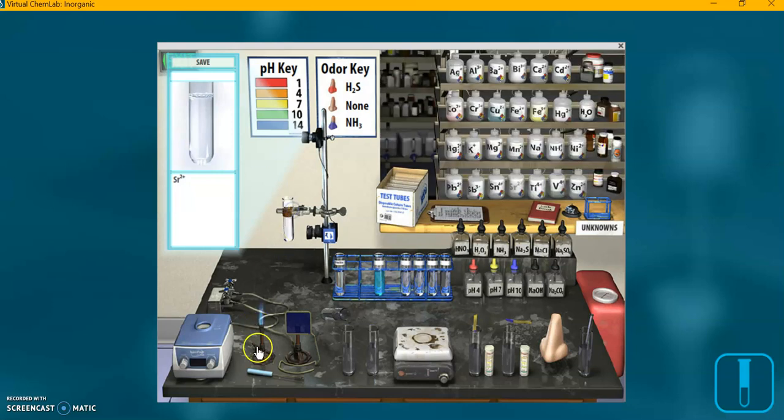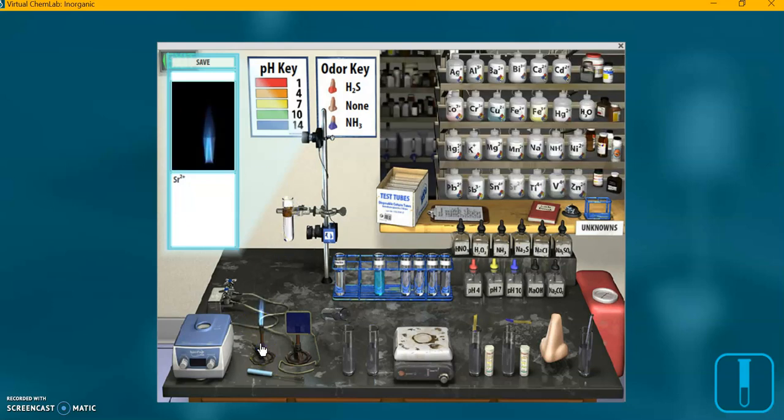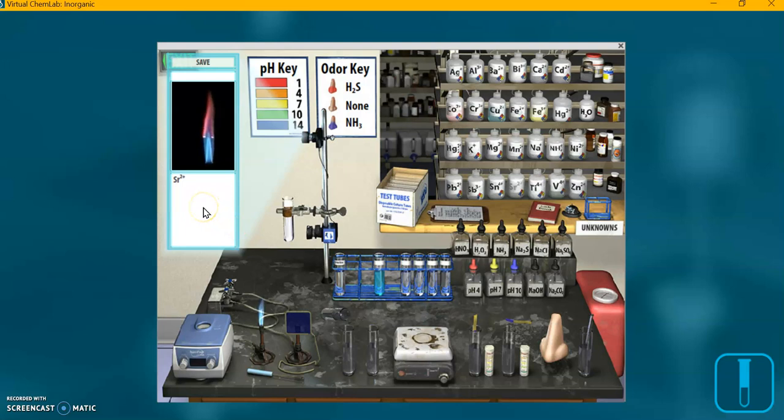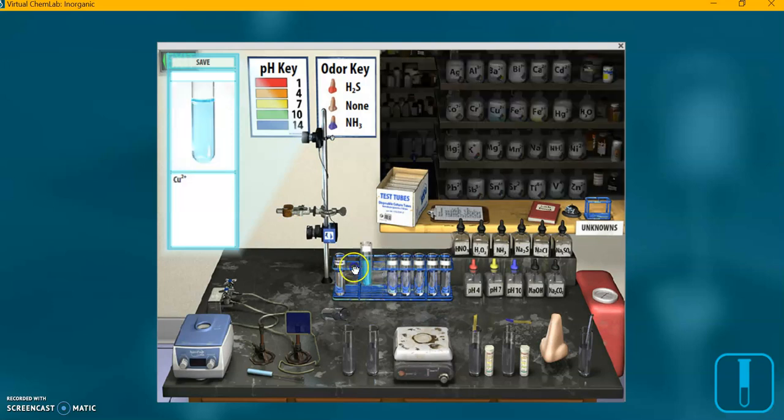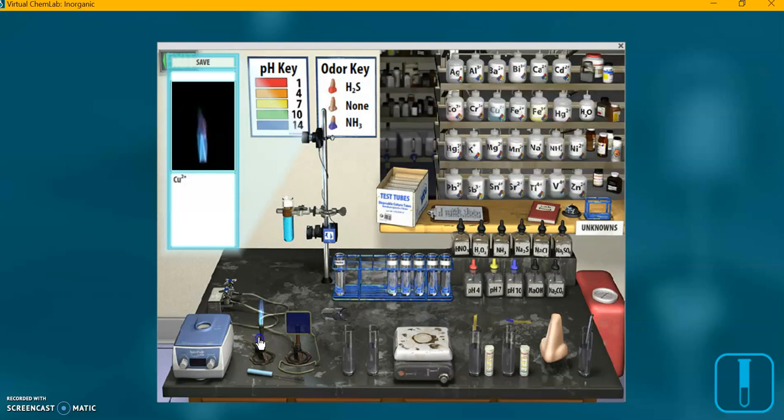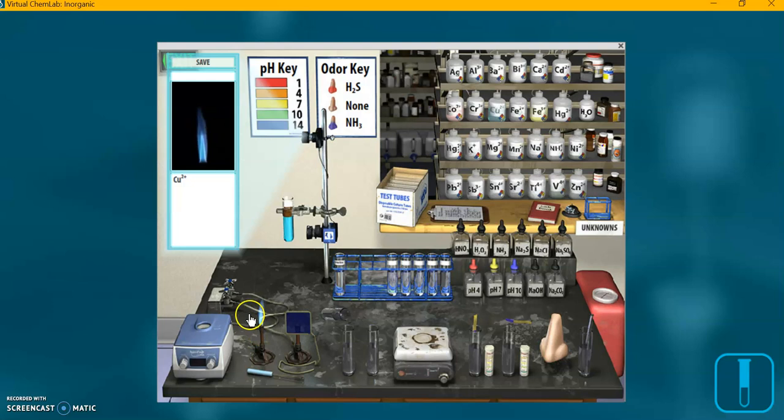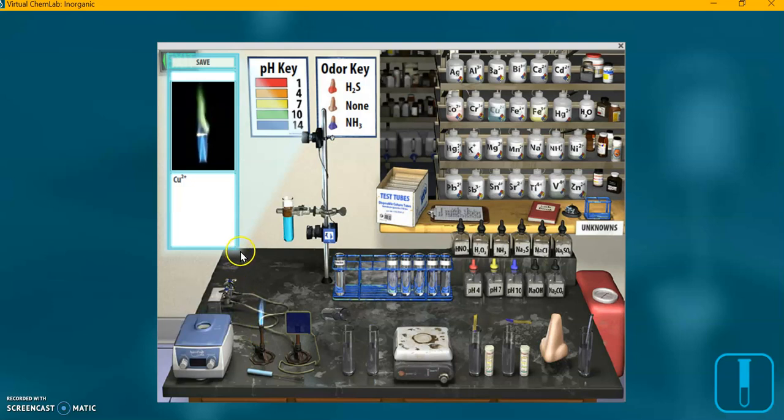Strontium. Finally, the copper. Oh yeah, that one definitely looks different too.